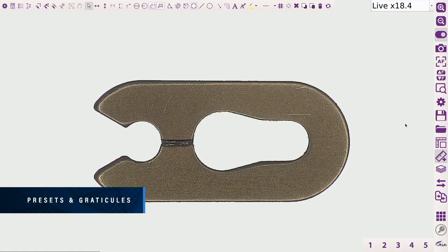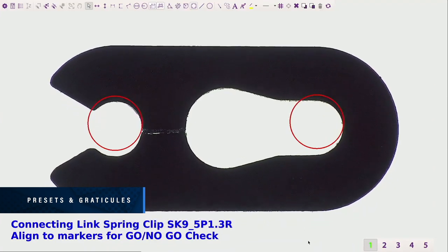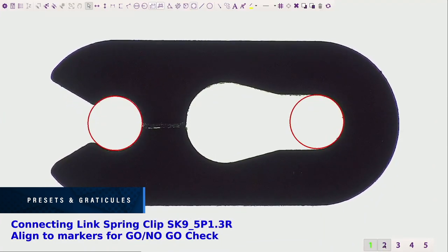On-screen preset buttons allow quick access to pre-configured part-specific system settings. On-screen overlays enable the go-no-go rapid inspection of samples.